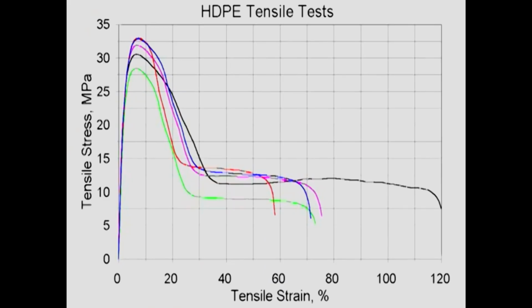And so the necking propagates along the sample, and of course, at the end, the material is broken, and you will see a lot of small fibrils, which is characteristic of a semicrystalline polymer. Yes, here, and this is the curve which is obtained.